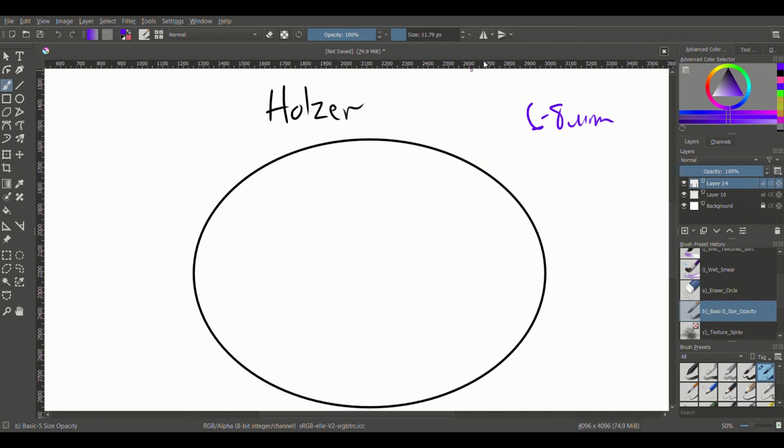We are going to put our sections into phosphomolybdic acid alcohol, drain that off, and then cover the sections with absolute alcohol chloroform. So at this point, we know we're working with some pretty hazardous stuff. Everything has to be done in a hood. This mixture is going to make them translucent. So you're really not going to see a whole lot on the slide at this point.